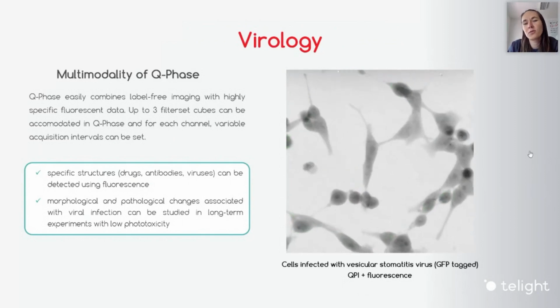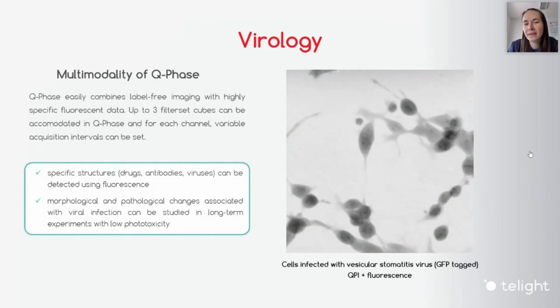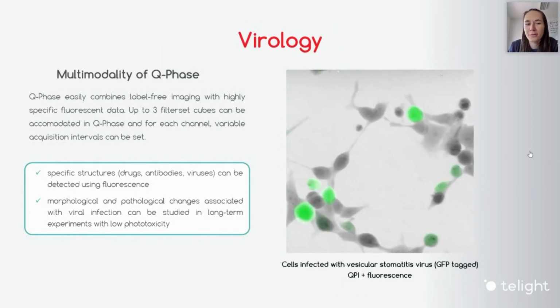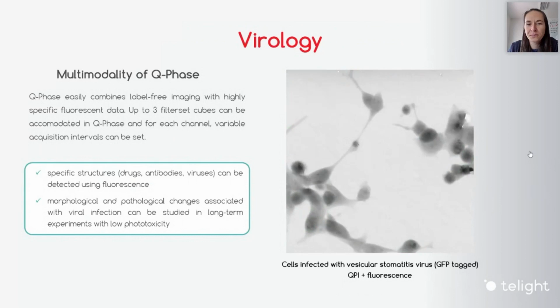So by combining these two modalities, we can see or monitor things which are, of course, below our resolution, like drugs, antibodies, viruses, and even small molecules and molecular changes can be monitored by combining these two modalities.